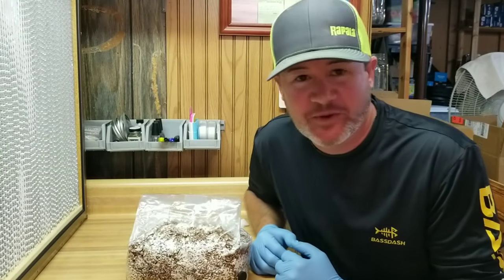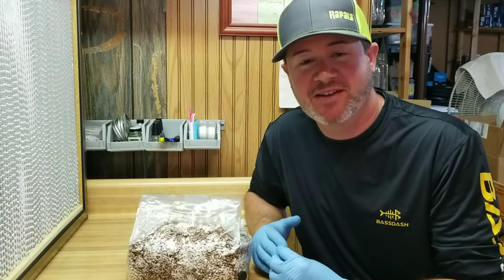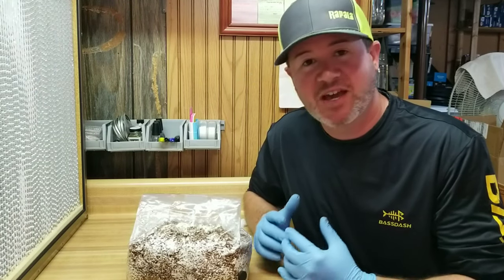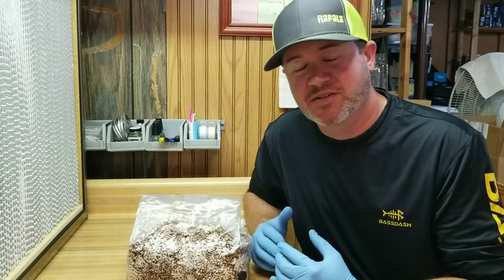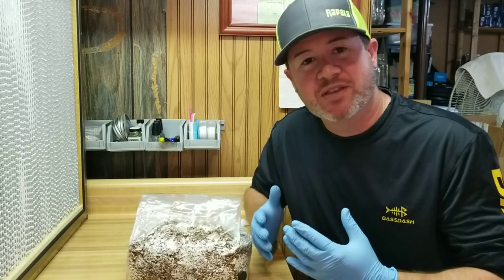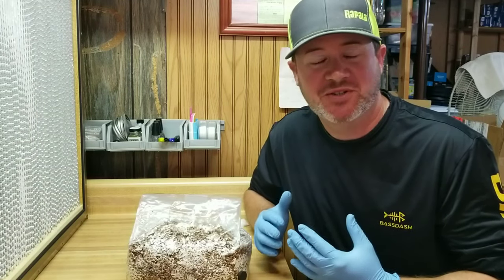Hey guys, what's up? Welcome back to the Renegade Mushroom Lair. Got another video for you guys today and this is kind of a cool trick. I've done this several times in the past and it's worked out really well for me. It's another way that you can capture a culture in order to grow a species of mushroom.